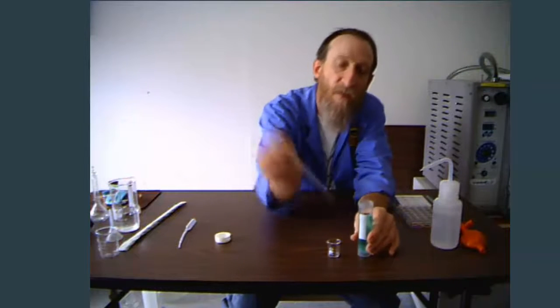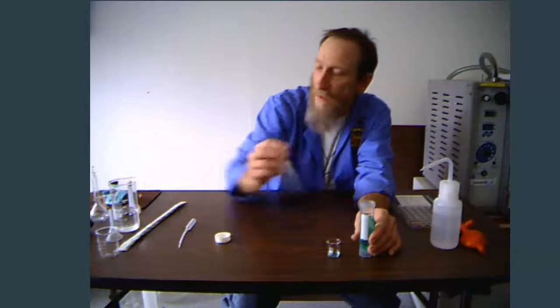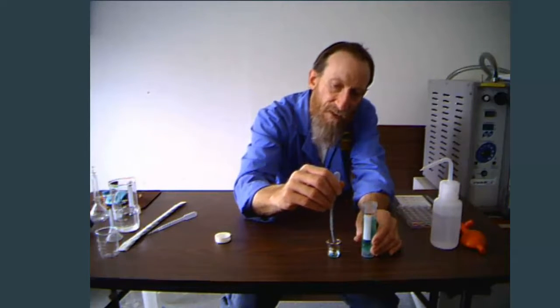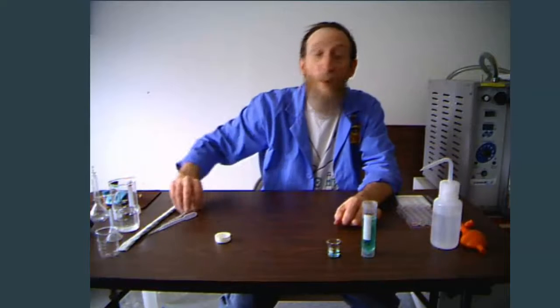These are called disposable pipettes, often called EERAL pipettes. They are transfer pipettes — for instance, if I wanted to transfer some liquid into this 10-milliliter beaker, you simply squeeze the bulb, release it, and squirt it in. Here's another type that has markings on it, though they are very, very approximate. If you wanted to add one milliliter at a time, these ones are marked in 0.1-milliliter increments, but again, very approximate.